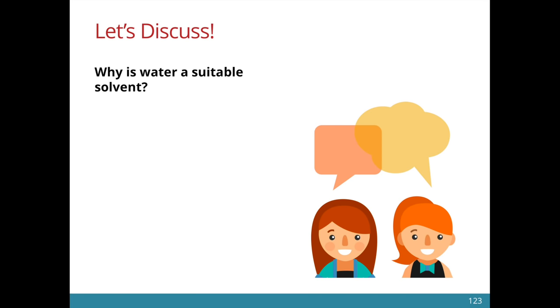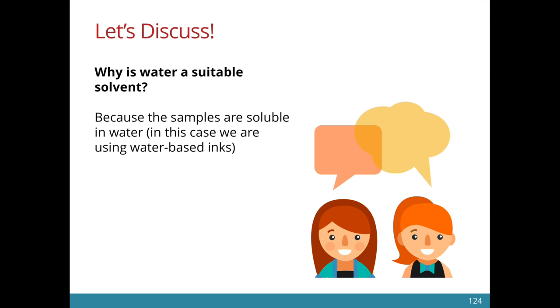In this case, why do you think water is a suitable solvent? The choice of solvent depends on the type of sample we are using. In this case, as we are using water-based inks, water is a suitable solvent because the inks are soluble in water.